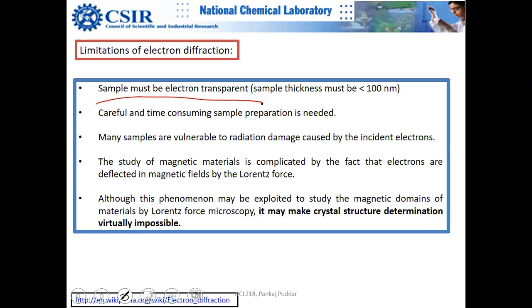Same thing is here. Sample preparation is time consuming and it requires some special skills. Otherwise you will not see anything. If you talk to some experienced student, they know exactly what concentration of dispersant to use, how many drops, how to dry, what to do, what not to do. So that is quite tricky. And believe me, colloidal samples, chemistry samples, are much easier.